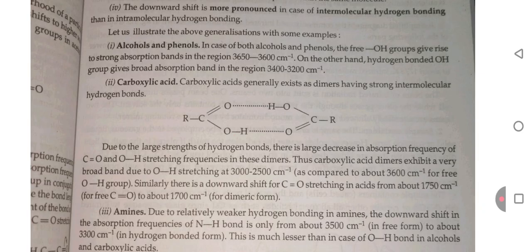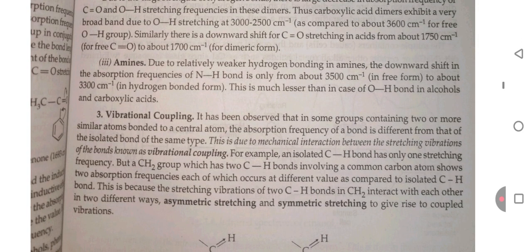Carboxylic acid. Carboxylic acid generally exists as a dimer having strong intermolecular hydrogen bonds. Due to the large strength of the hydrogen bond, there is a large decrease in the absorption frequency of carbon double bond oxygen and OH stretching frequency in these dimers. Thus, carboxylic acid dimers exhibit a very broad band due to OH stretching at 3000 to 2500 centimeter inverse. Similarly, there is a downward shift for carbon double bond oxygen stretching in acids from about 1750 centimeter inverse to about 1700 centimeter inverse. Amines. Due to relatively weaker hydrogen bonding in amines, the downward shift in the absorption frequency of the NH bond is only from about 3500 centimeter inverse to about 3300 centimeter inverse. This is much less than in the case of the OH bond in alcohol and carboxylic acid.